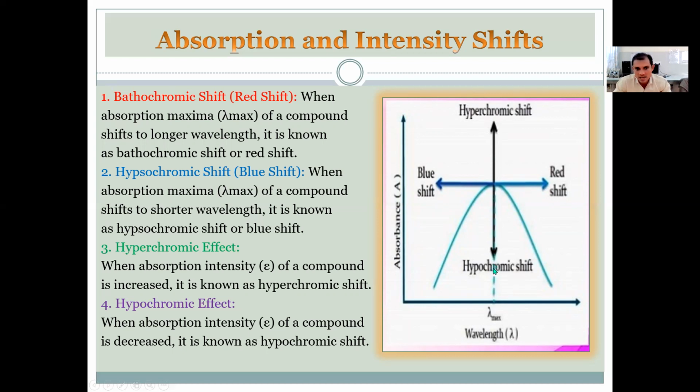So it is called hypochromic effect or hypochromic shift. Okay, is it clear?